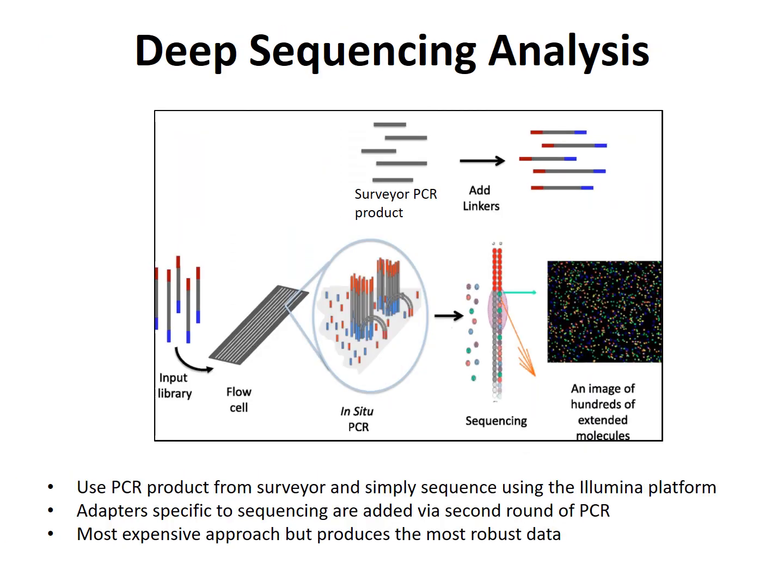And so this is another approach to analyze your indel frequency, typically not used for day-to-day gene editing when you're just trying to make knockout cell lines. This is more frequently used when you're trying to do something for therapeutic uses, or you need really, really accurate numbers of the amount of gene editing that you're getting.